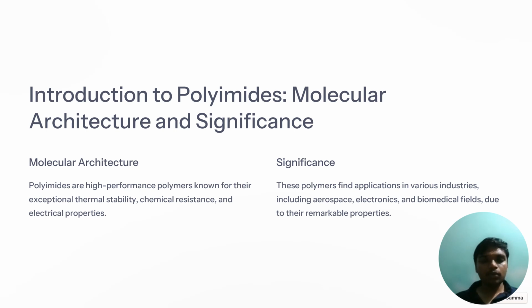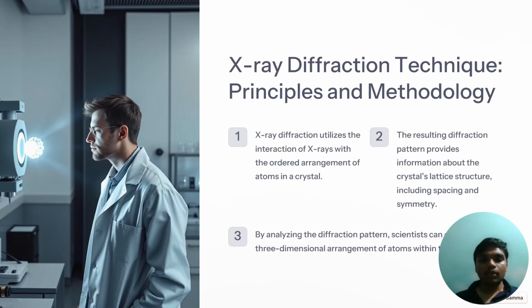The ability to observe their crystalline structures can give insights into their physical properties such as strength, elasticity, and thermal stability.